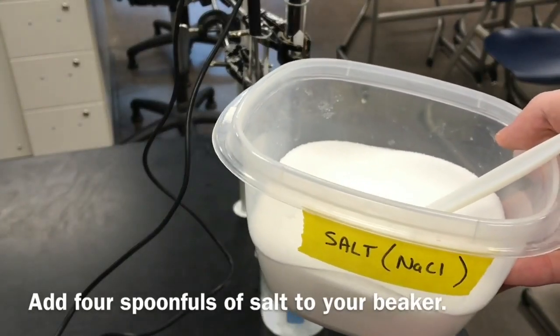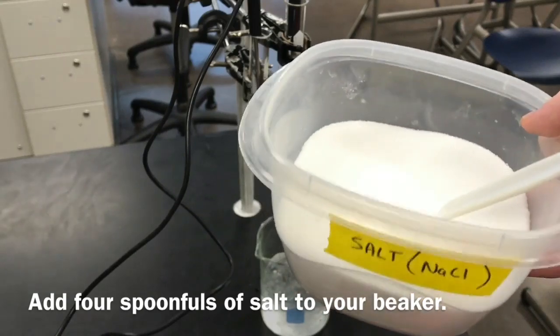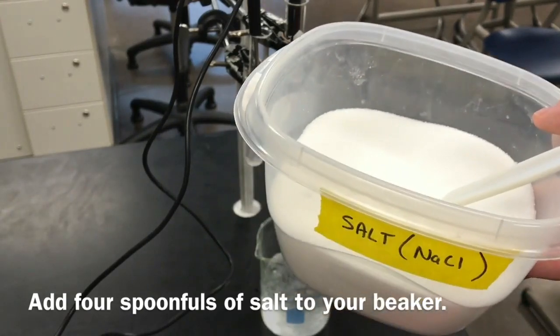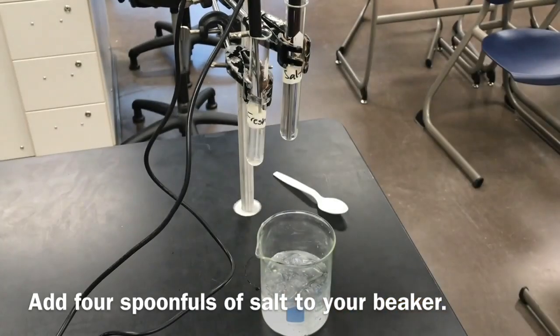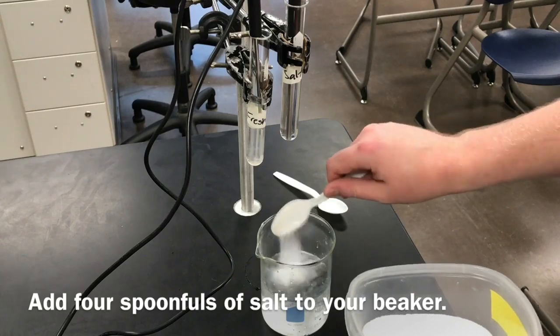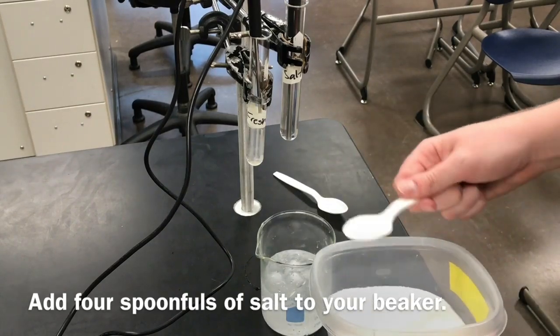Take some salt from up in the front. I've got a couple of these containers up in the front. Be sure to just grab what you need and then bring it back, because I don't have enough containers for every group here. And I'm going to mix in 4 scoops of salt.